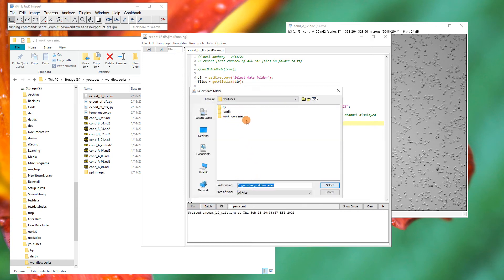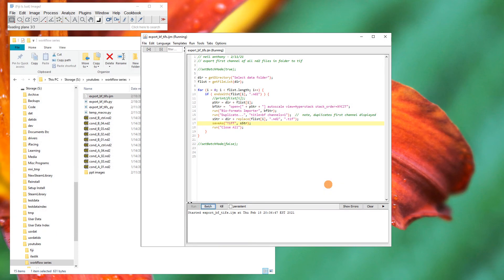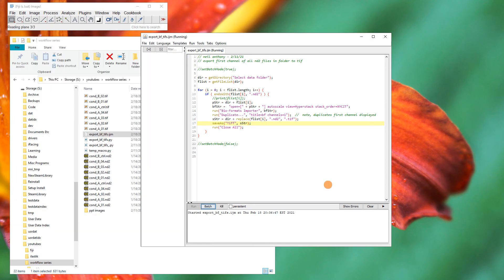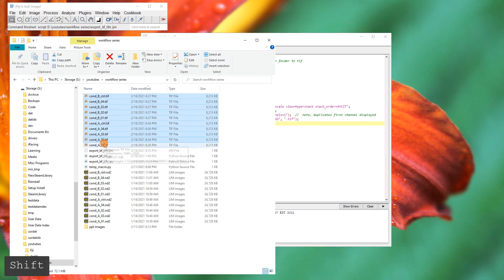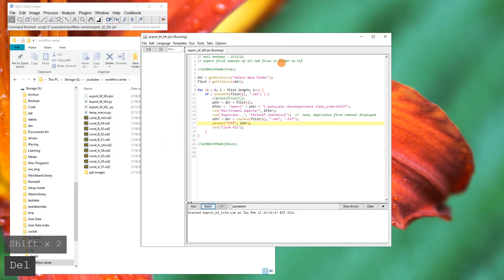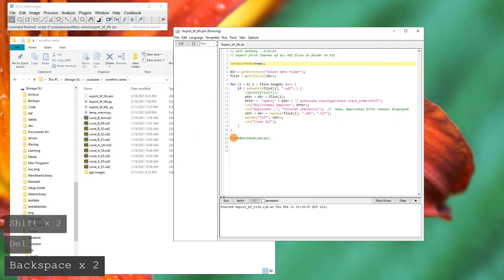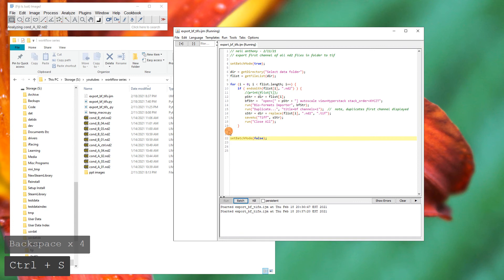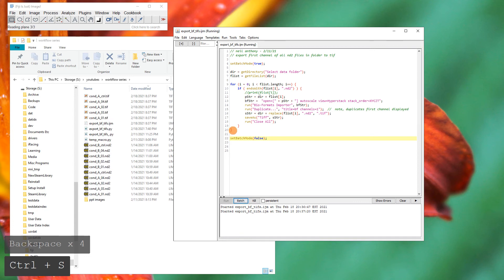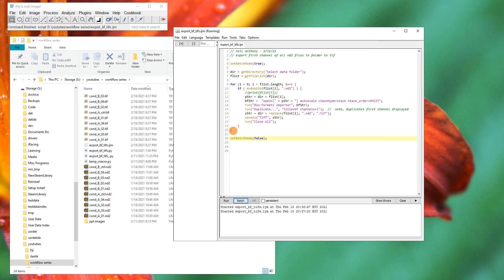To run the macro, select the folder at the bottom and hit run — it will pop up windows and close them in sequence. This is not the most efficient approach; it's nice to see what it's doing when you have multiple stages, but once you're happy you should enable batch mode. Let's remove the comments, save, and run again — we'll see it's about twice as fast, which makes a big difference if you have a long list of files or very large files.